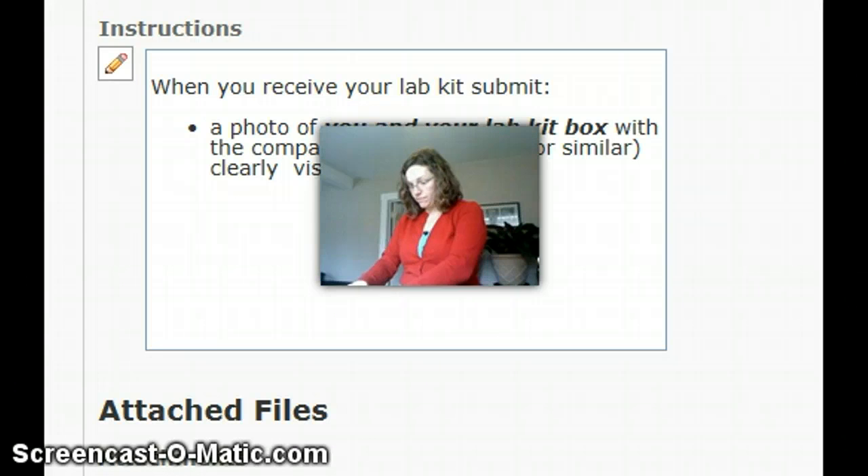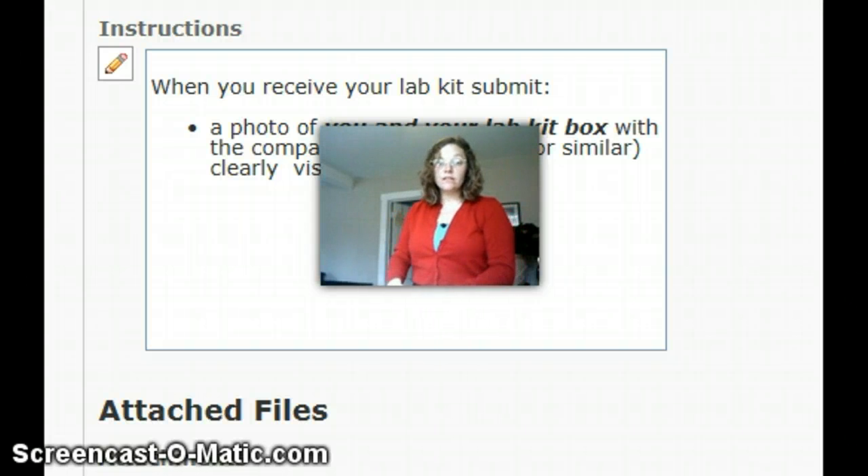There's also a dissection kit and some bins for growing things.